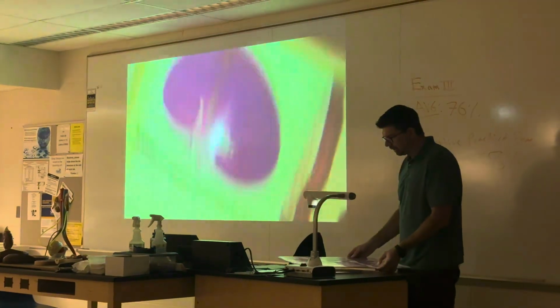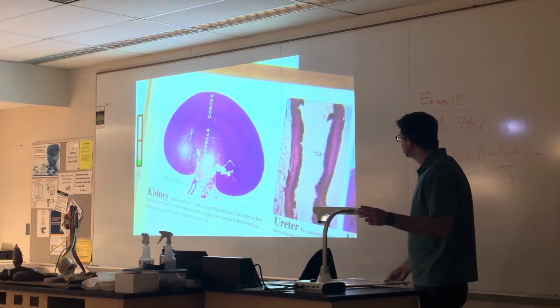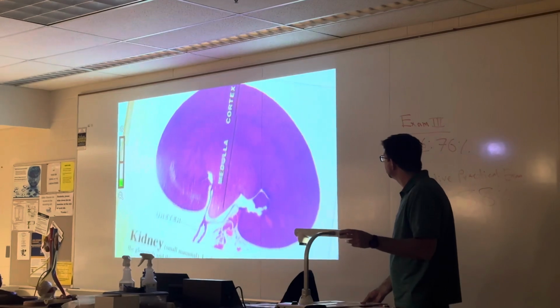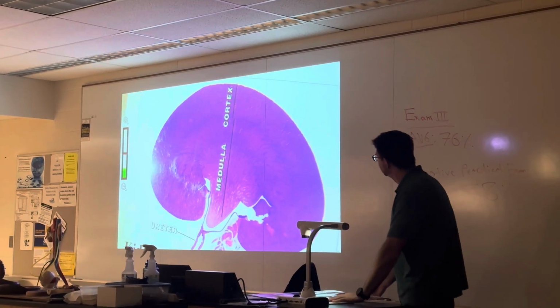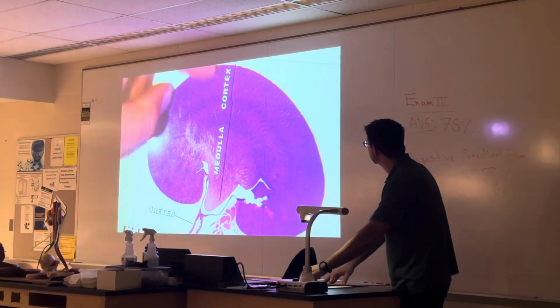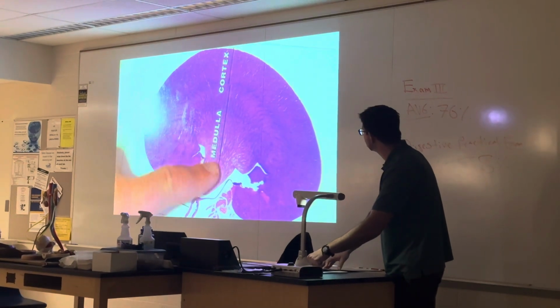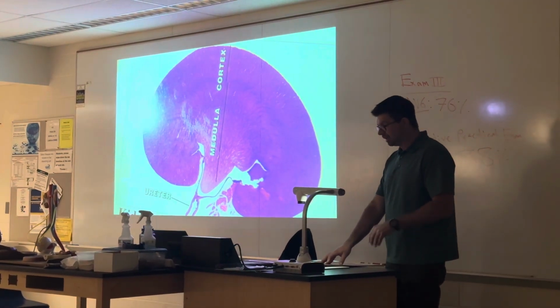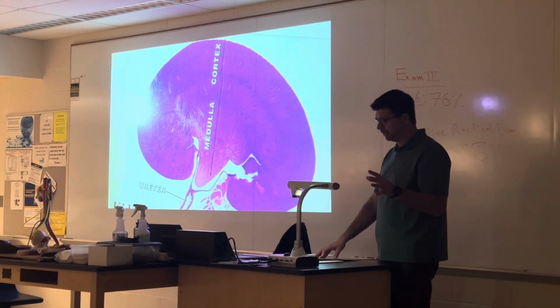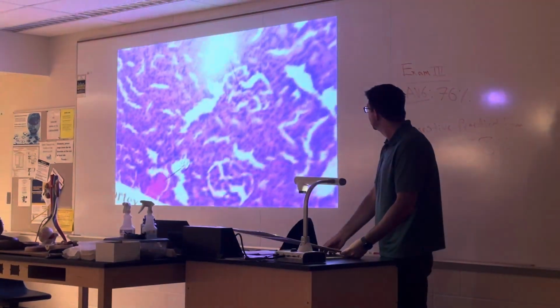All right, our regions. Let's start with a large magnification here. See a nice large field of view. And here we have our kidney. So we have our renal cortex. Again, that's kind of the outer region of the kidney here. And more internally is the renal medulla. But how can we ultimately decipher and differentiate between the two regions? Well, here's a great way.